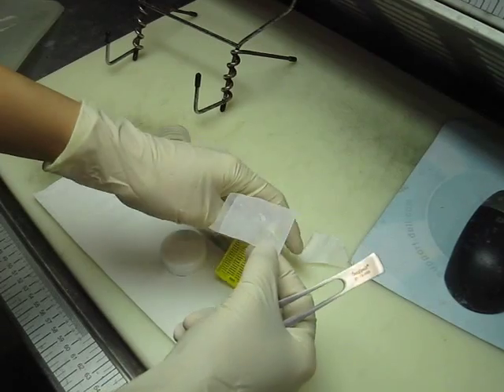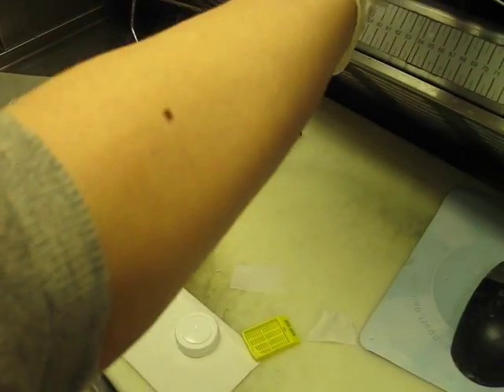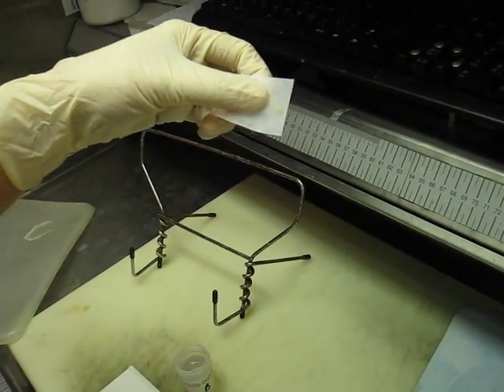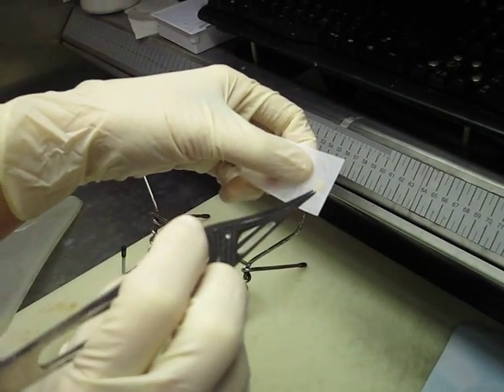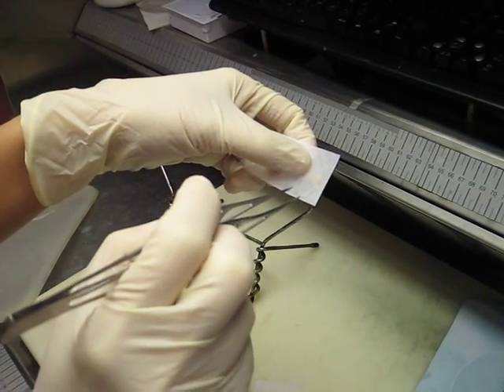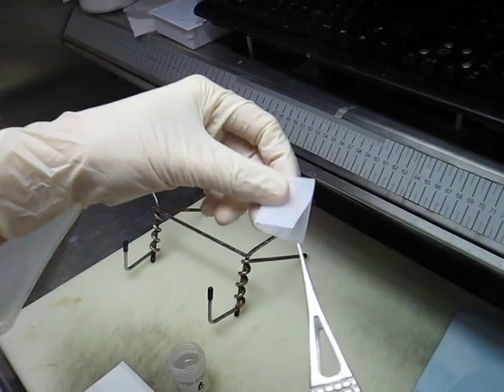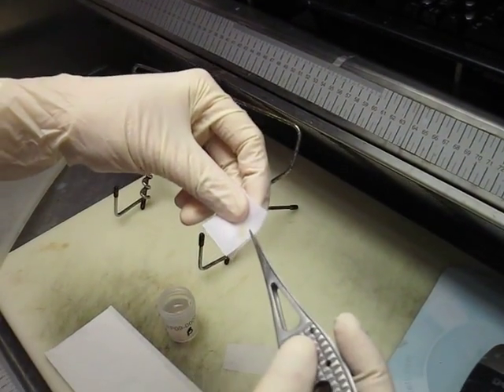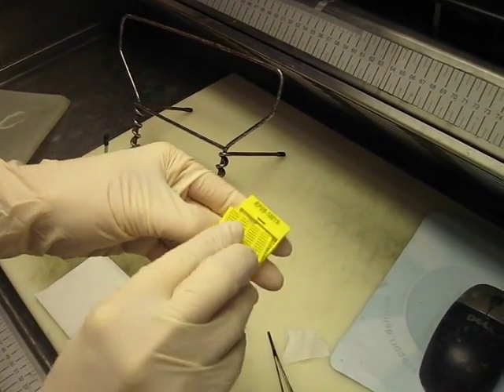So this particular specimen, at this point, the person grossing would say, or type into the computer, received in formalin labeled as such and such is a 0.5 by 0.5 by 0.3 centimeters tan white tissue fragment. And the specimen is entirely submitted. You have to specify whether it's entirely submitted or partially submitted. So this specimen is entirely submitted in one cassette.